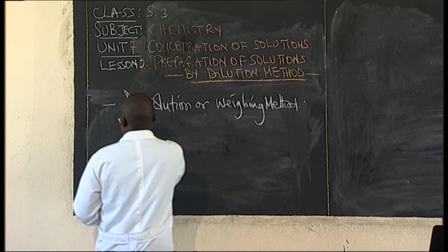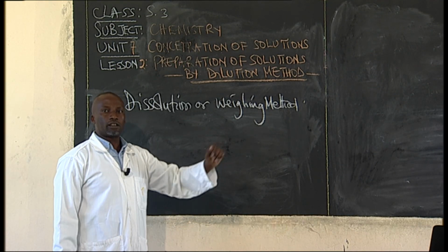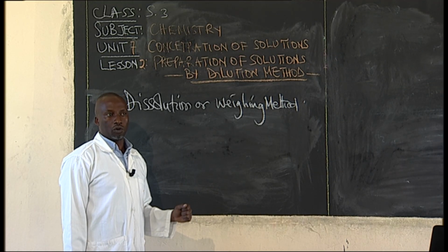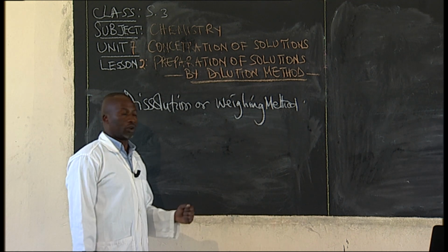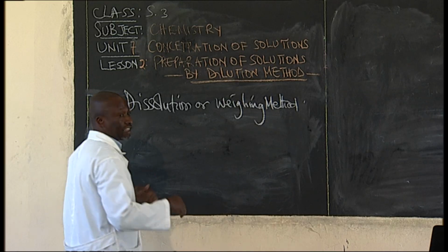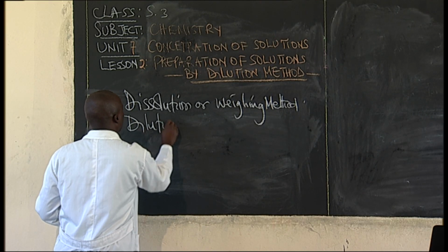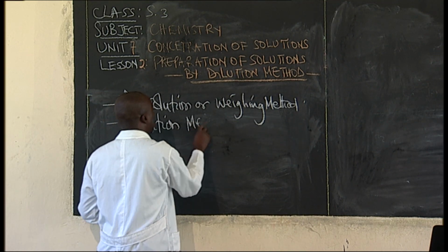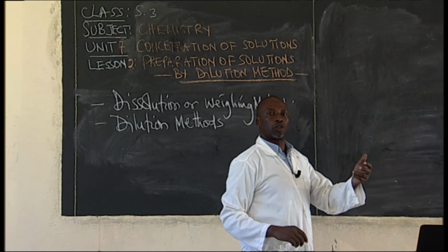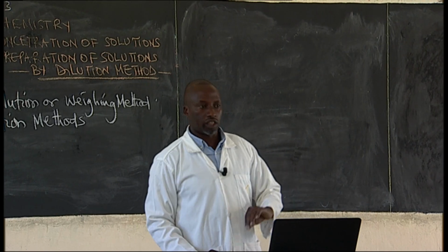So today we looked at this one. We'll just again look at some exercise that I left behind with you and see whether you are able to do it. So today we're just going to look at another new method, which is the dilution method. So there are two methods, dissolution or weighing method, or dilution method.